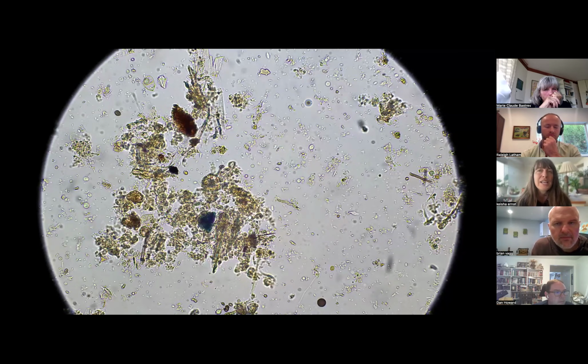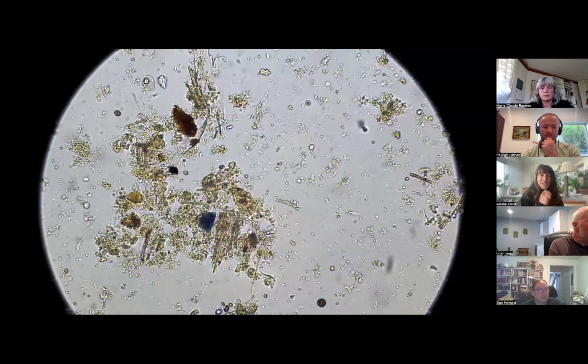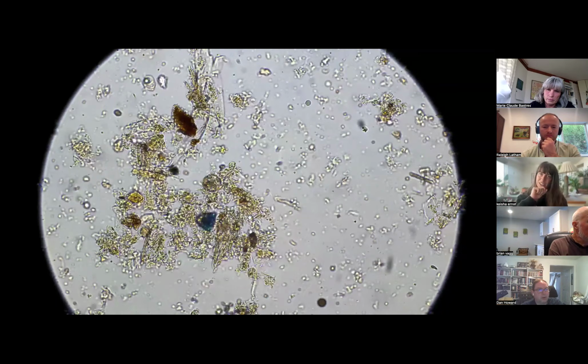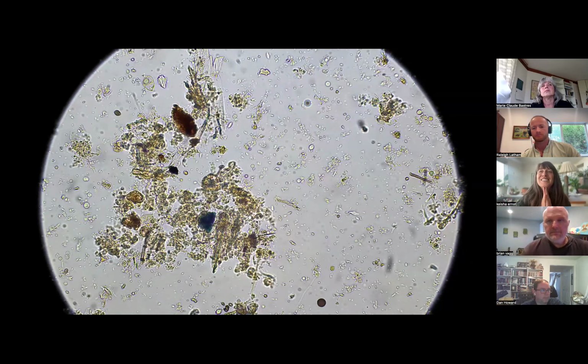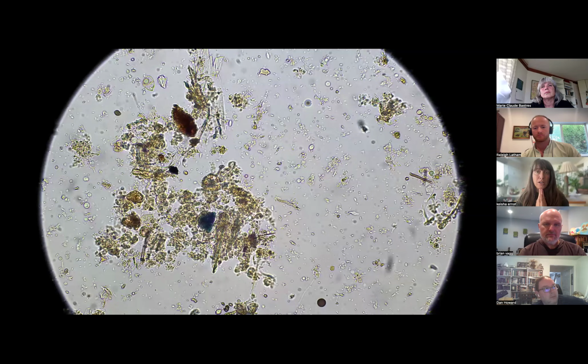And I use this format when I do a lot of events where I'll have, say, 300 people that I meet during the day, and 25 of them bring me samples and they want to know just something about their soil that's useful. So I'll run these little 5-minute quick checks and at the end, you can look over and say, oh, wow, look, we're seeing X amount of testate amoeba every few views. We're seeing fungi, but we're lacking nematodes. And it's just a really simple tool to be able to engage with your clients that might not want to pay a lot of money for a sample, but they want to have some sort of idea of what's living.